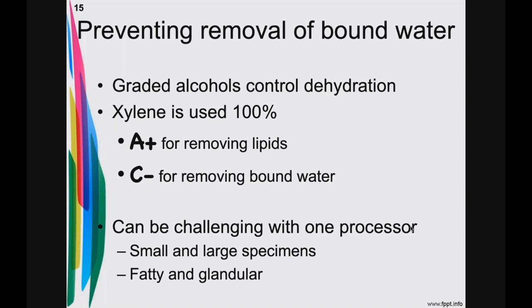So that's great. Graded alcohols we have control over, but we don't have control over the xylene. We use xylene 100% pure. We don't have 95% xylene. Most of us use it full force, so we have 100%. So xylene does a wonderful job. We give it an A-plus score that it can remove the lipids, but we've got to watch our time in there because the longer it sits in there, the more time it's going to remove the bound water.